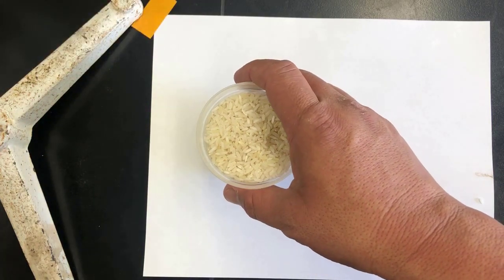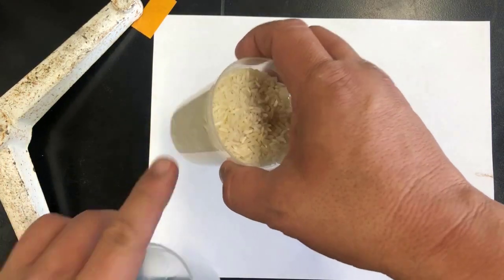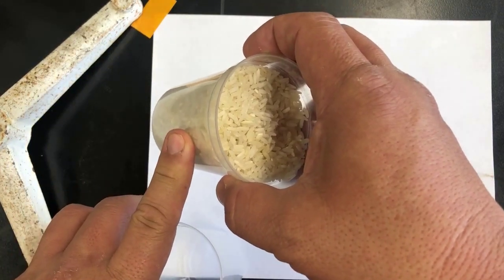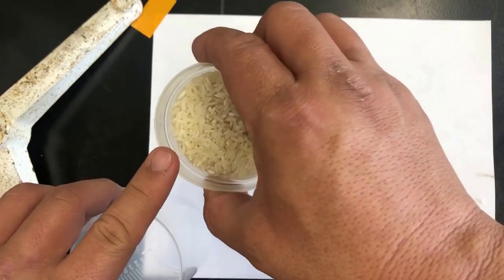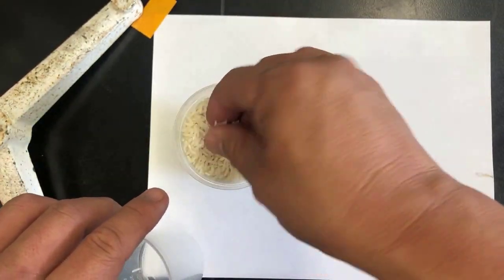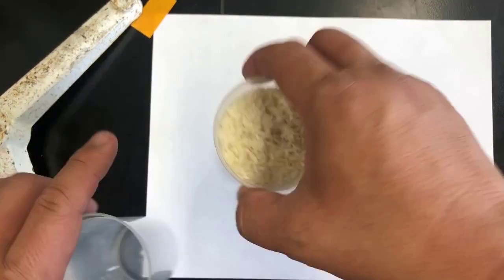We'll get an average mass of a grain of rice, and we're going to have the mass of the rice in the beaker. Then we'll be able to calculate the number of grains of rice inside this beaker.